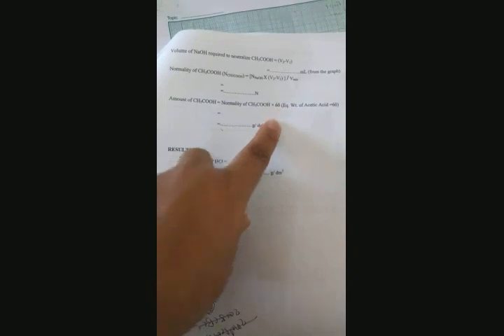Similarly, the volume of NaOH required to neutralize acetic acid is V2 minus V1, as I explained. Normality of acetic acid is given by N1V1 equals N2V2 again. So multiply with V2 minus V1 ml, divided by V mix, where V mix is the volume of acid mixture prepared. The amount of acetic acid is the normality of acetic acid into 60, so you will get so much gram per dm cube. So at the end, the result will be amount of HCl is equal to so much gram per dm cube, and amount of acetic acid is equal to so much gram per dm cube.